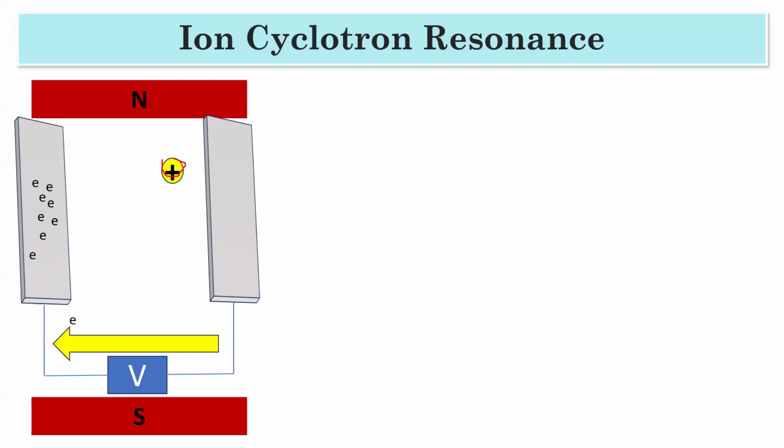Guru is asking: if we have two molecules of similar mass, how do they travel, and is it possible to identify them in TOF? Don't say similar mass; as I talked about yesterday, we should not say similar mass. The best way to say it is, if you have isomers with the same chemical formula, then it will be difficult to distinguish them by this mass analyzer.